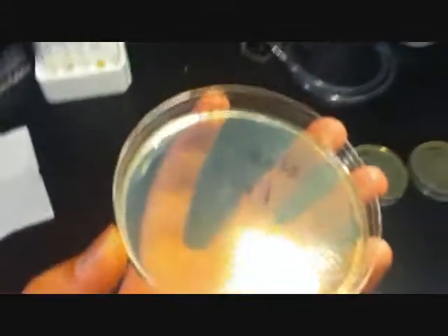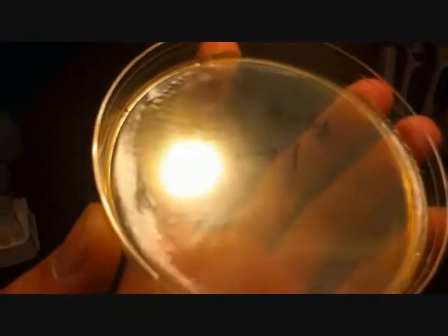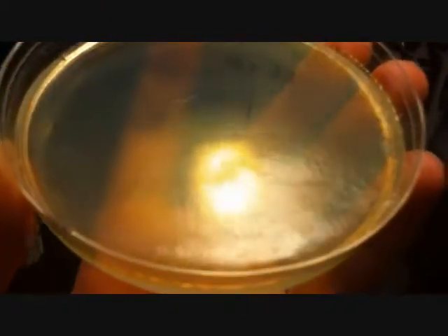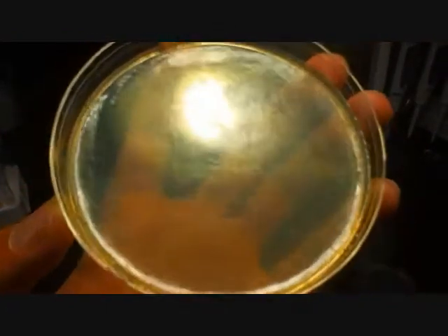The H2O, which you see there — I don't know if you can see that — actually had so much bacteria that you can't even see the individual colonies with the camera. You have to look really closely, and even then I don't think the camera is powerful enough. There was just so much bacteria, there was no space in between. You'll have to take my word for it.